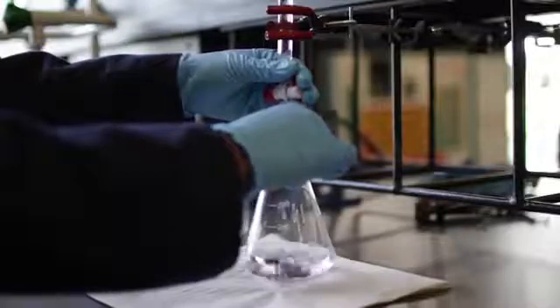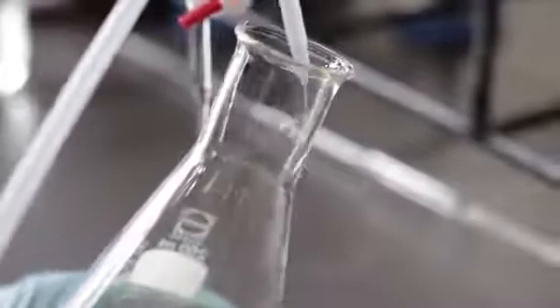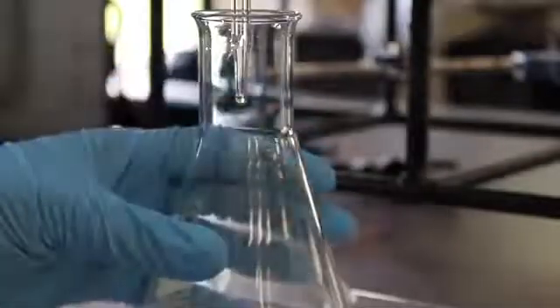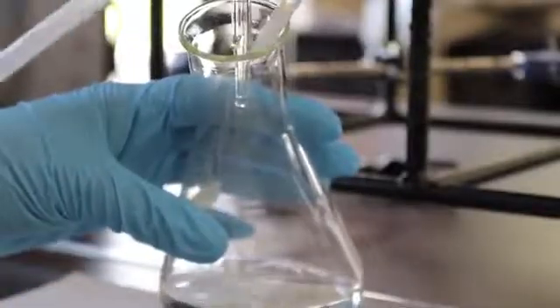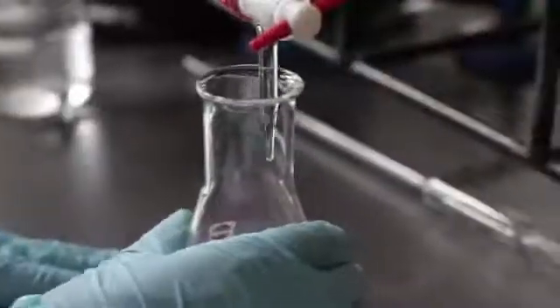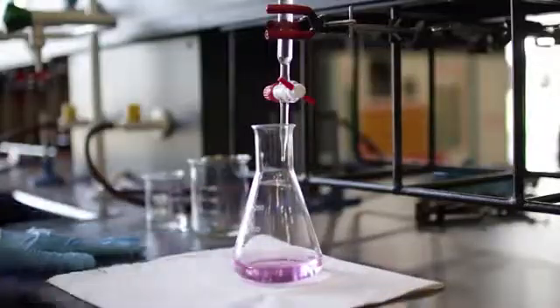When approaching the endpoint volume, a good habit is to wash the sides of the conical flask with distilled water from a wash bottle, as when swirling, the side of the conical flask will touch the tip and some of the titrant will stick to the walls of the flask. If there is a droplet hanging on the tip of the burette, wash the droplet into the flask using a wash bottle, especially when approaching the endpoint. Washing off the titrant will result in a more accurate and precise result.